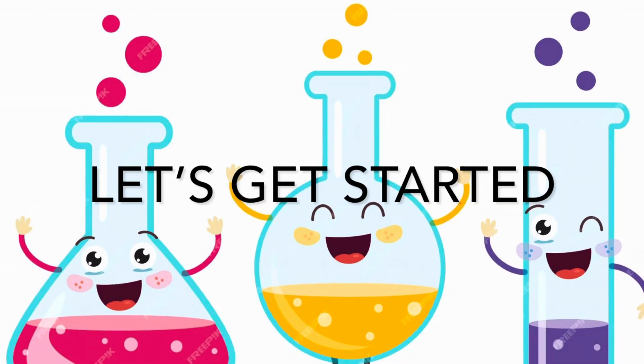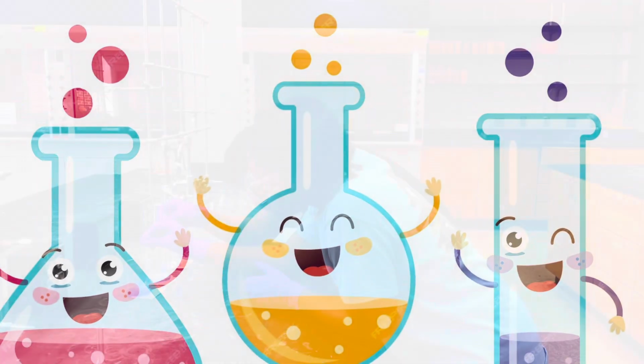Before we start today's video, we first need to discuss what exactly we are doing in today's lab. We're going to split this up into 4 steps. First, we're going to perform our serial dilutions. Second, we're going to transfer our solutions into tiny containers called cuvettes. Then, we're going to move all of our cuvettes to the spectrophotometer room to collect data with the spectrophotometer. And then lastly, we're going to take the data which we collect and do a little bit of math. With that said, let's get started.